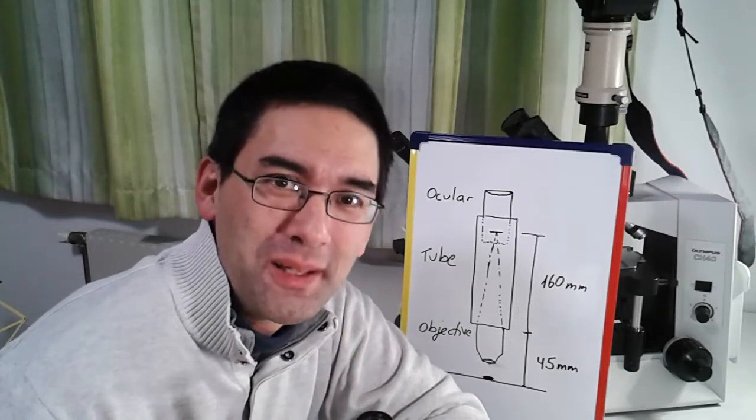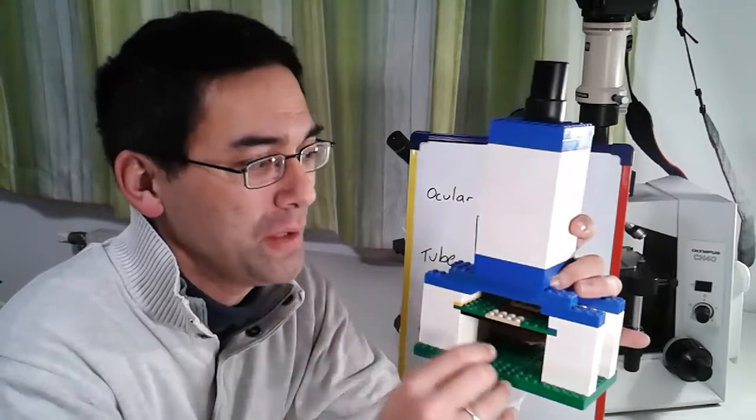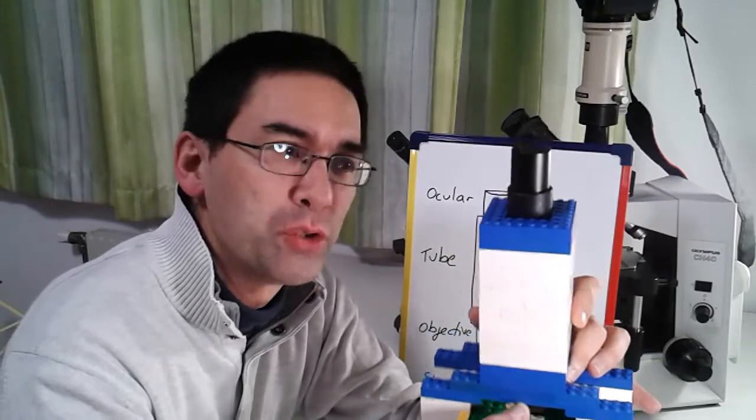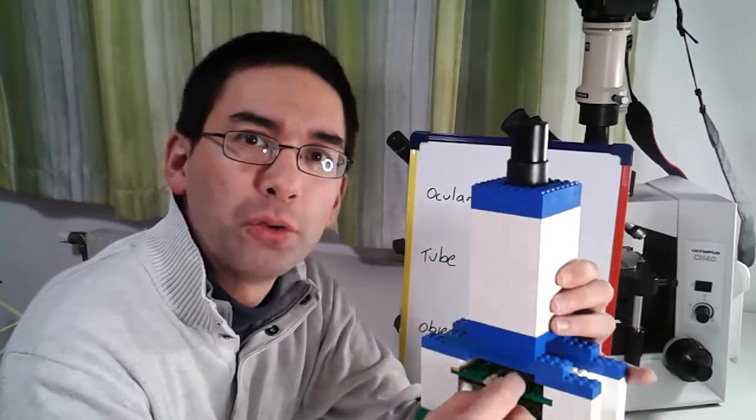Hello and welcome again. Today I'm going to show you how to make this Lego microscope here. It's a pretty simple construction, but it works surprisingly well, and I'm going to show you how to build it.